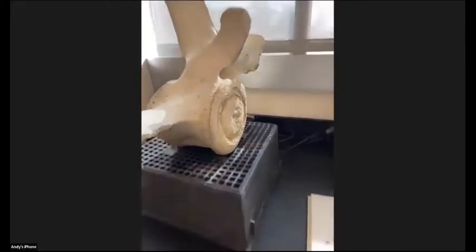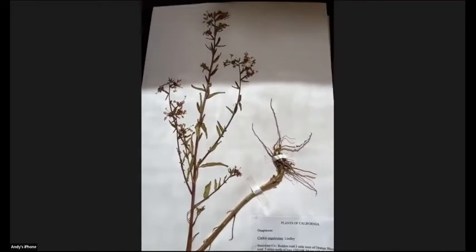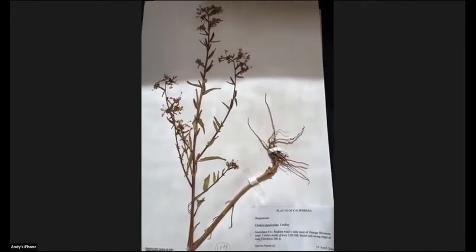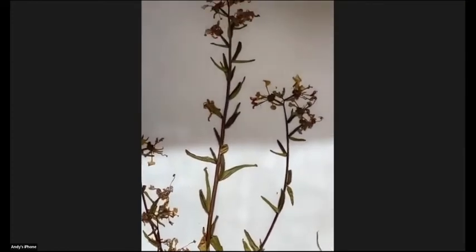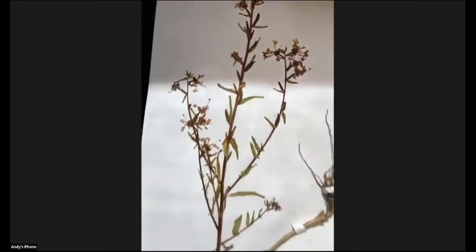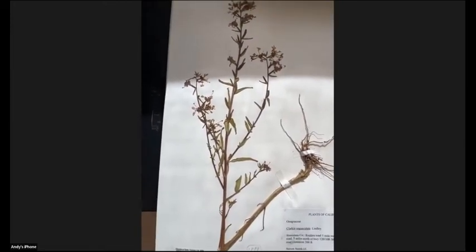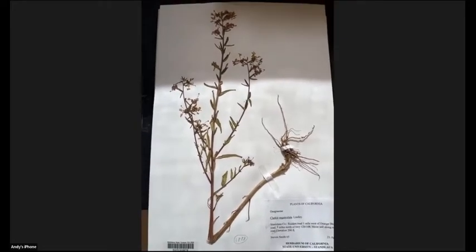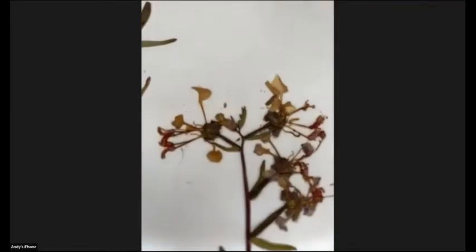All right, now we're going to go to specimen number 5, right here. This specimen is a little bit different. I'm sure you can guess what this is, at least, you know, generally. Roots of a plant. What about this part? Could you zoom in more on the top part of it, Lynn? What do you think those parts are?